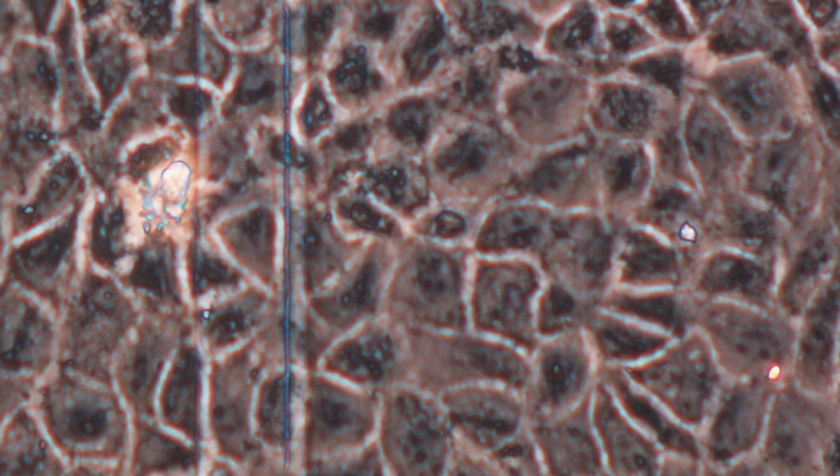For example, this image of epithelial cells shows cells that have been electroporated on the left side of the image, transferring lucifer yellow to neighboring non-electroporated cells, creating a gradient of glowing cells from the edge of the conductive coating toward the right. This image shows the same frame of cells under phase contrast. Note that you can see the etched line very clearly.